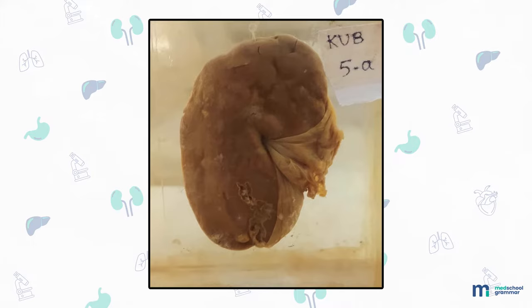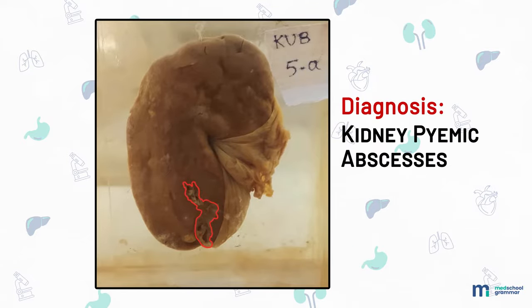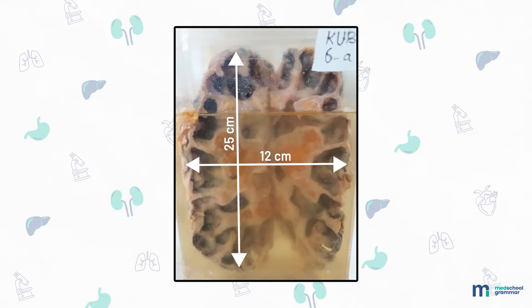Specimen of kidney measuring 8 by 5 by 1.5 centimeter. Capsule stripped off. Subcapsular surface shows multiple pale yellowish-white areas of varying sizes; one at lower pole shows necrotic material. Diagnosis: kidney pyemic abscesses.